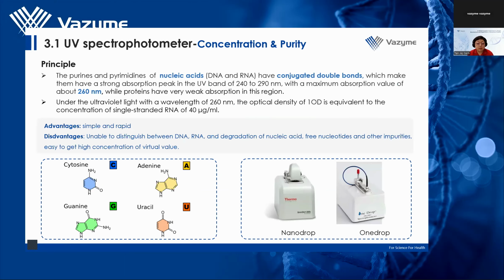One of the most frequently employed tools in scientific research is the UV spectrophotometer, which quickly determines the concentration and purity of RNA using NanoDrop or OneDrop. The detection principle relies on the fact that nucleic acids exhibit maximum absorbance at 260 nanometers, whereas proteins show their maximum absorbance at 280 nanometers. By measuring the absorbance peaks at different wavelengths, the RNA concentration can be calculated. This method is straightforward and convenient, but it may yield inaccurate values at low concentrations.